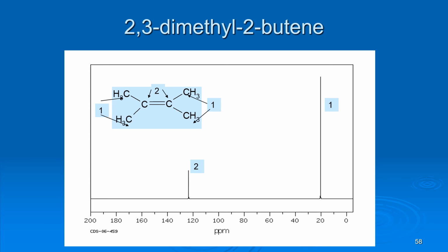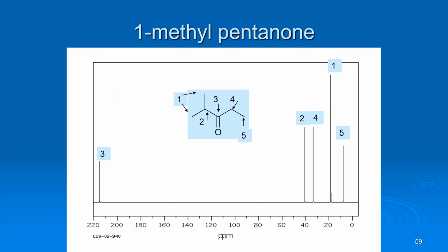All right, just look at a couple more examples. Again, we said this one has 2 possibilities. The one that's got the double bond should be further to the left. The 4 that have the single bond are over here. Now there's 4 carbons over here, so this will have an integration of 4, and this one will have an integration of 2. These 1s and 2s are just labels. This carbon that we said, these 2 are identical, and then 2, 3, 4, 5. Of course, the one on the C double bond O should be the furthest over here. That's an equivalent of 1.